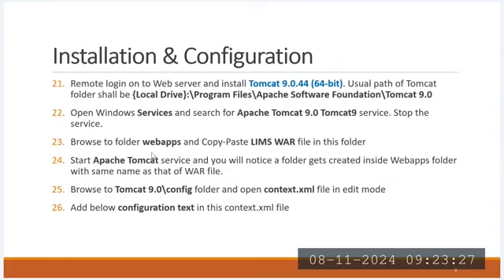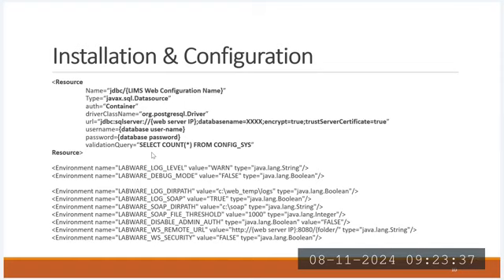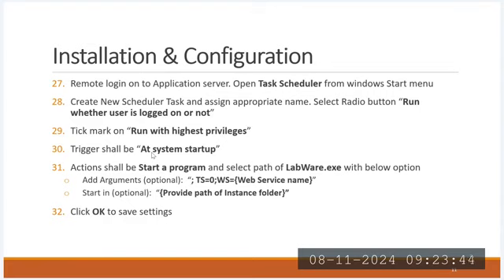And this will also be the same way I have communicated earlier. Tomcat servers related, remote login for desktop, like database server access, everything. This is somewhat basic information, so I don't want to discuss these. And remote login, how to take the access, like RDP servers control purpose. We will use some of the logics the way the SQL database team recommended.